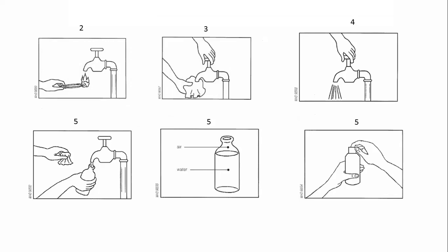So you can see the procedure. The second picture shows you the head tap, and we have a lighter, and they have poured alcohol on this cotton, and they have lit a flame to sterilize this particular head tap. And we have the other procedure, where you wipe with cotton and then open up and let it flow. Also, another thing I forgot is that when you are done with the sterilization, you open the tap for about 1 minute, and then you collect your sample.